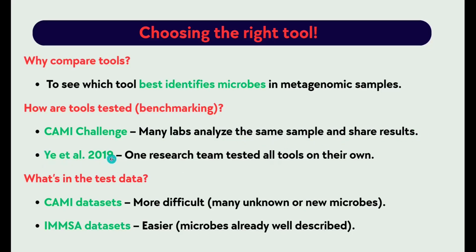The second is Ye and his research team in a study published in 2019. This one research team did everything themselves. They ran all the tools on known datasets, and then they compared the results.